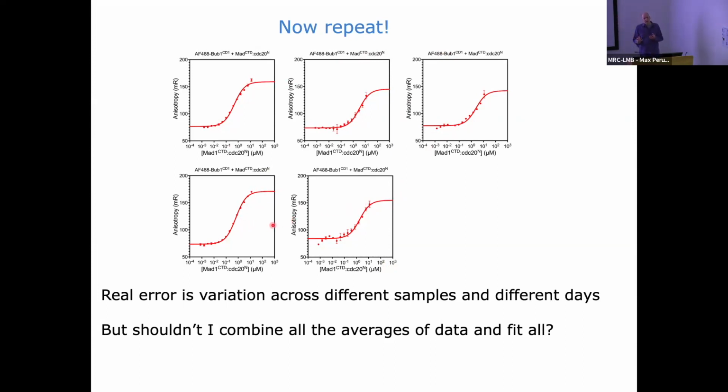One question we had is, well, you've done all this, you've repeated it, different times, and shouldn't you just then average everything together and then take the average of that? And that would be the question of no, because you're then discounting the fact that you're maybe certainly getting different amplitudes on different days. So don't ever do that.